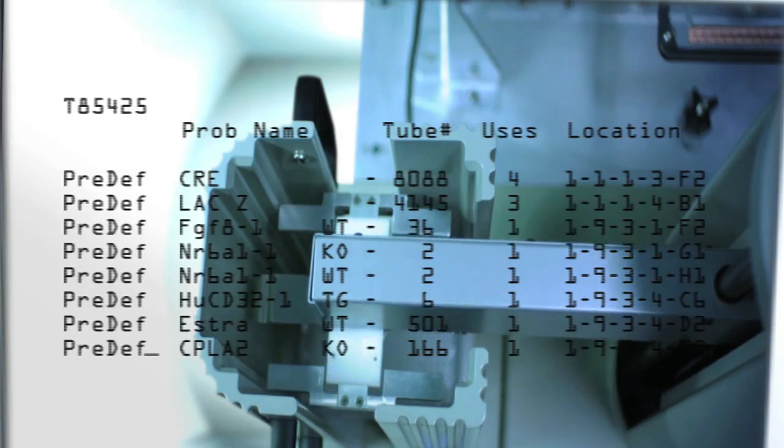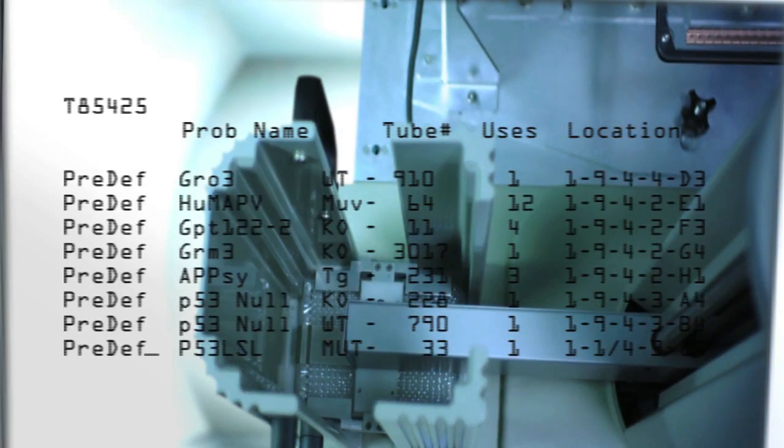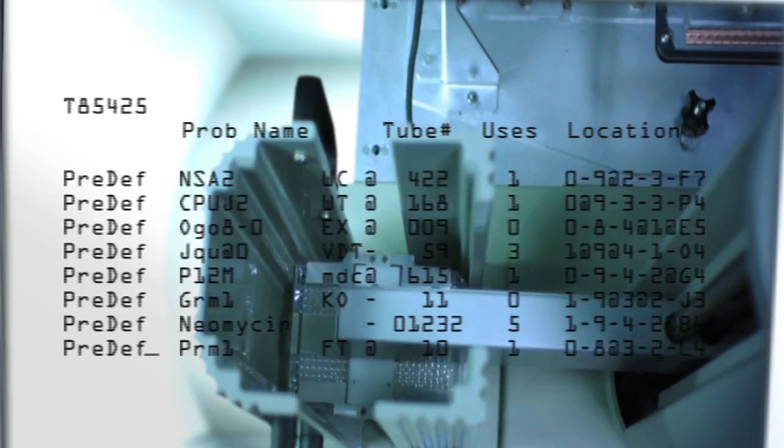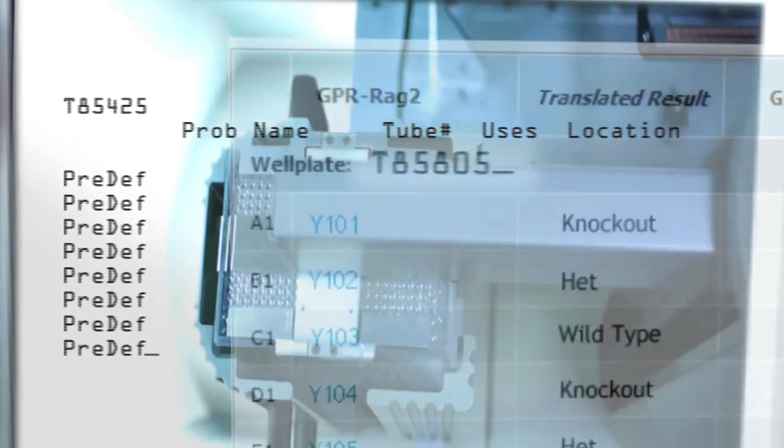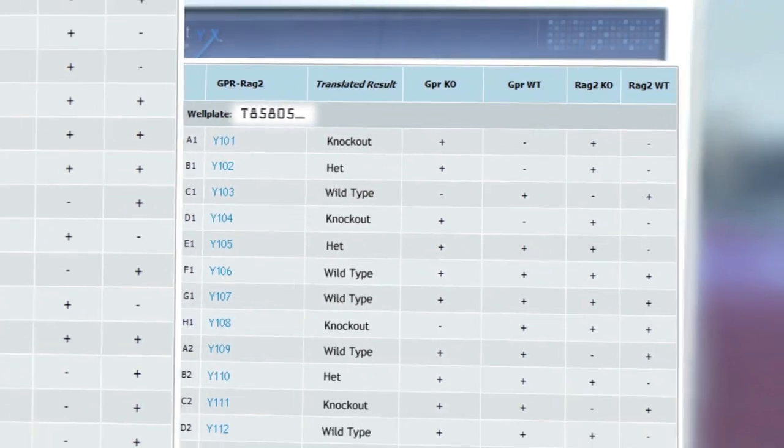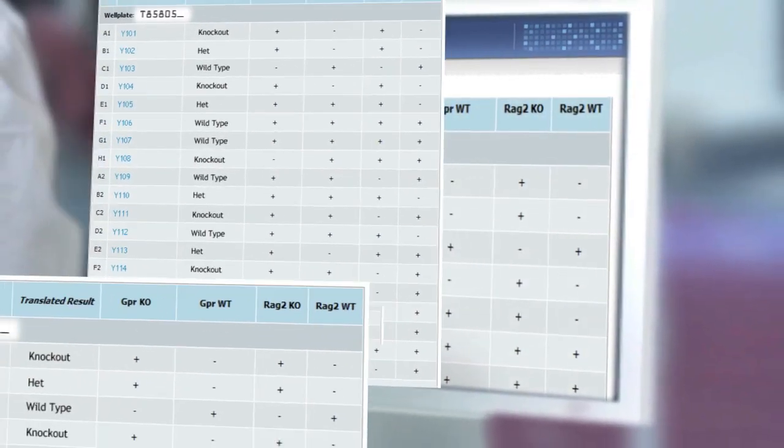Next, a robot arm picks up the plate and loads it into the ABI 7900. The data is processed through our LIMS system where more than 100 quality control checks are evaluated, and then, after having satisfied those criteria, the results are posted online to your password-protected account.